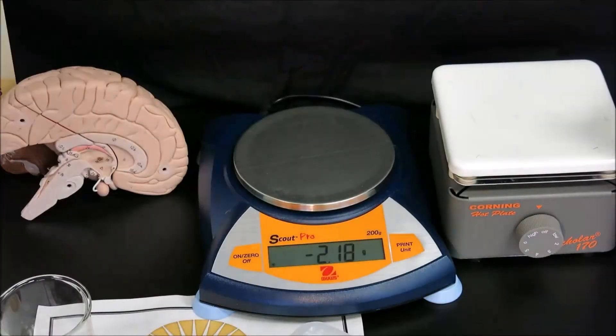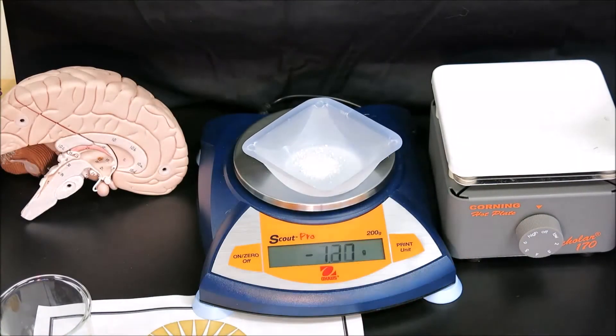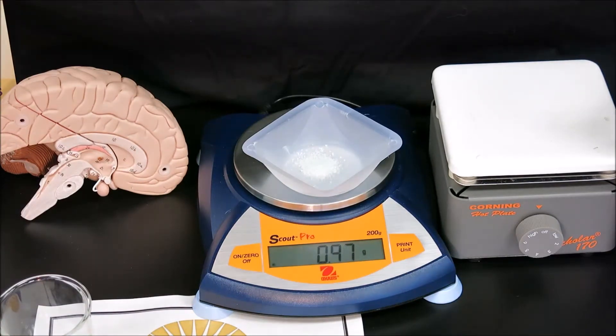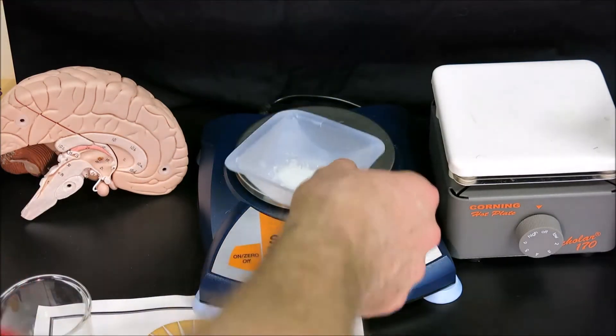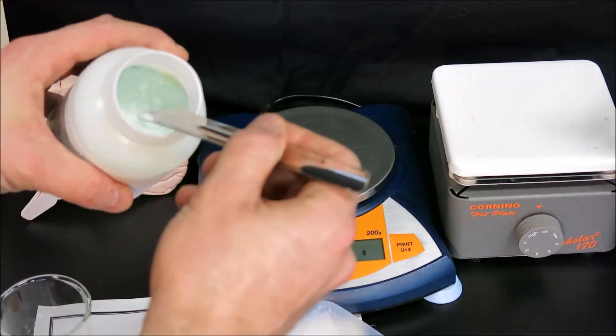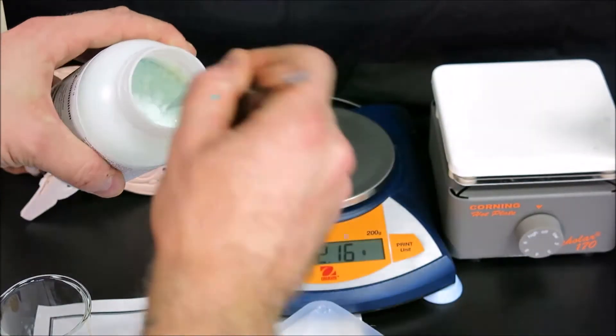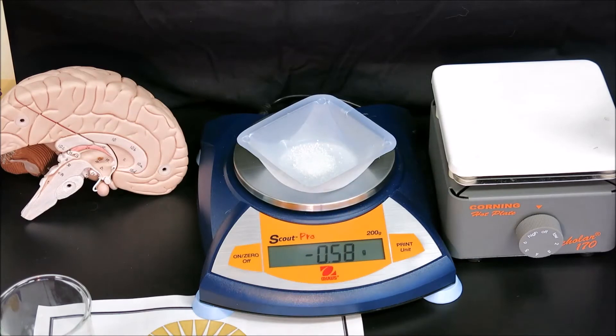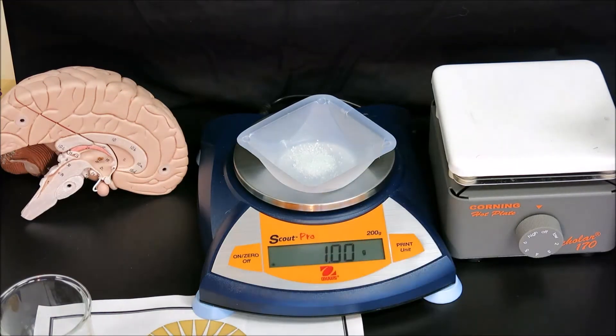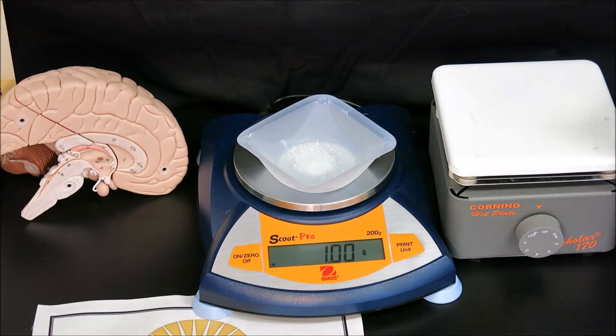If we do get excess solid, we cannot put it back into the container and must put it into our waste container. While this may take some time, you end up with a very accurate mass such as 1.00, and we don't have any waste. Now we can put our spatula in the waste container, close our stock container, and get ready to prepare the solution.